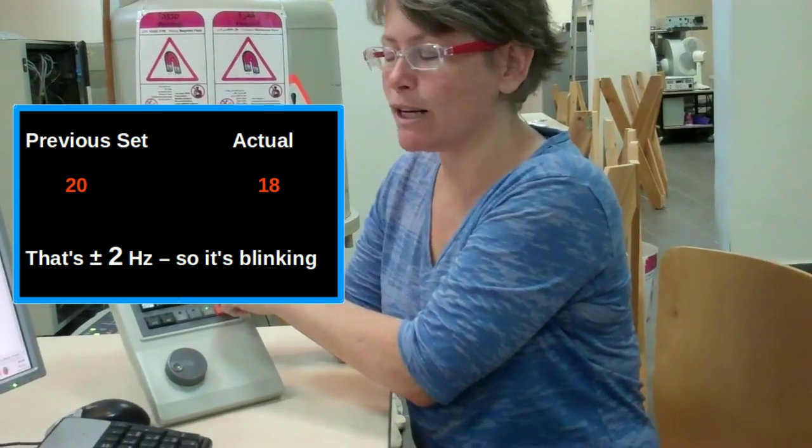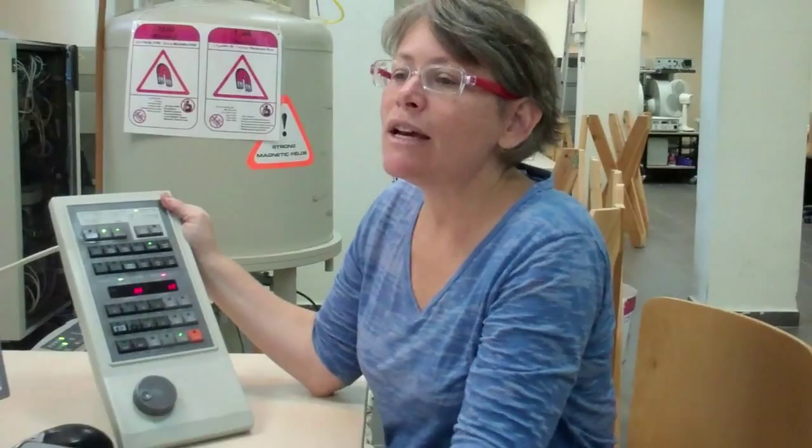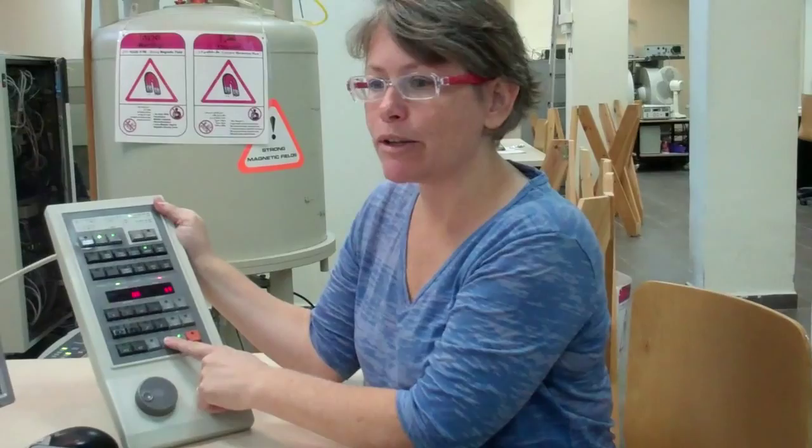Here it's plus or minus 20 hertz, and so the spin rate button is blinking. To deactivate the spin rate, spin measure button, we press standby here at the bottom middle.